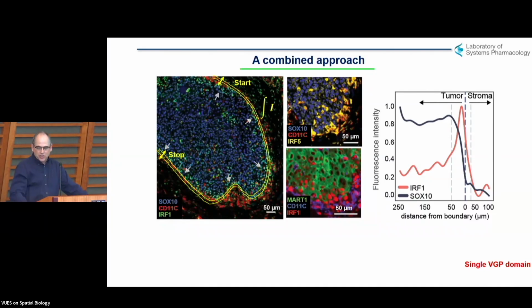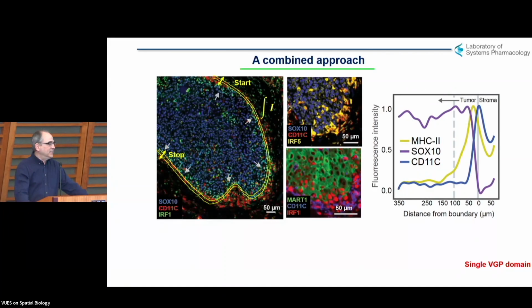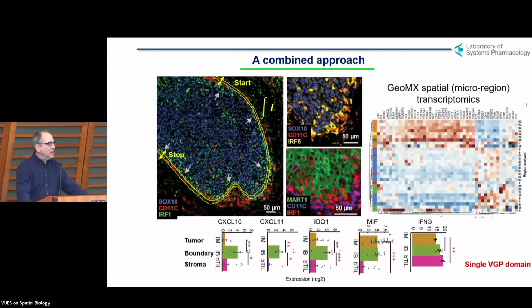that's 3 cells wide. And you can sort of see that represented here with just a couple of the channels. And I'll give you one more set. So this shows that we have a rapid falloff in the tumor compartment, a rise in the stromal or local environment, and that there will be expression in this case of critical immunosuppressant genes that is 1 cell thick along that edge.